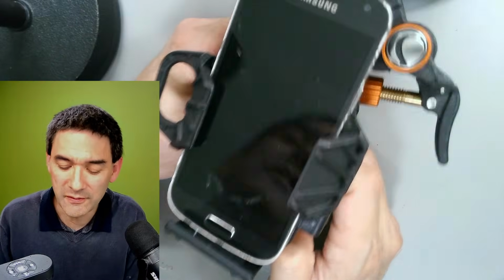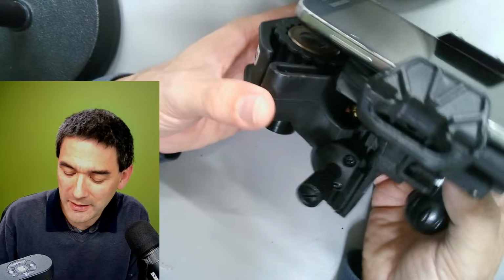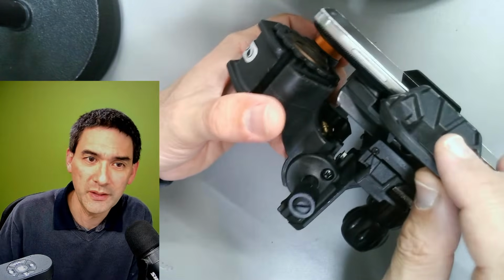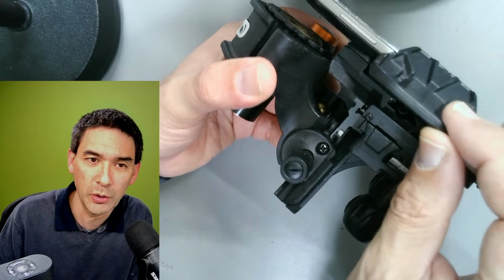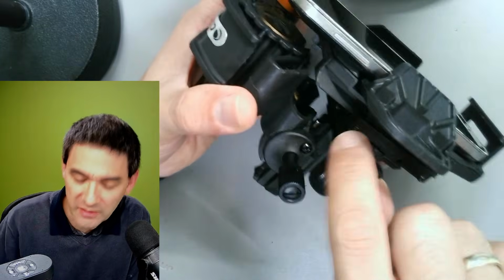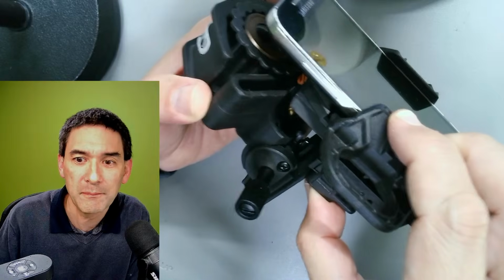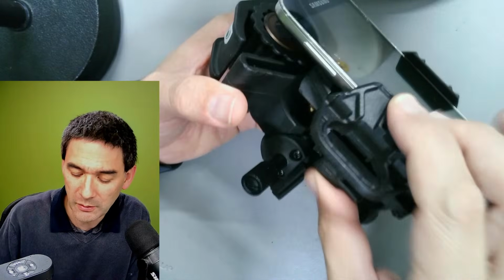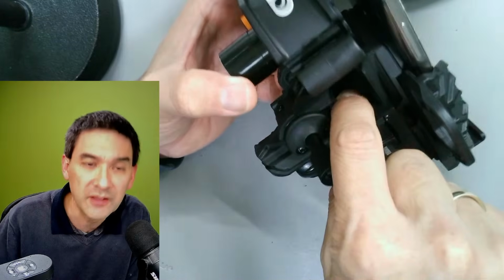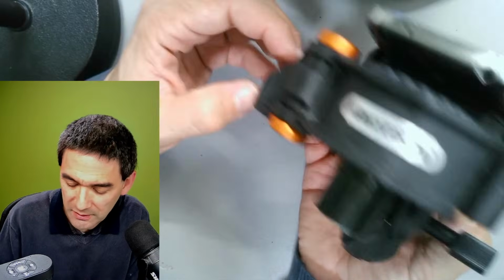So this means it gives you the maximum control of the different axes, but it's a huge one. And I also want to show you, of course, there are some tolerances. That's to be expected, and for this reason there are tiny screws that you can tighten to lock everything in place. So once it's set up, the whole thing is not wobbly anymore because you can tighten a few screws. I think the one over here, I don't know if you're able to see that.